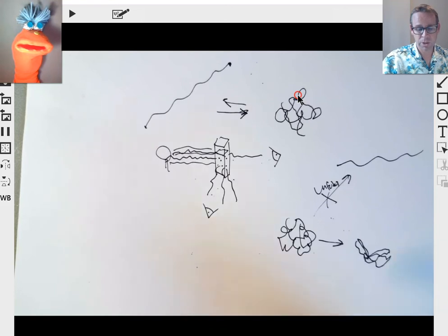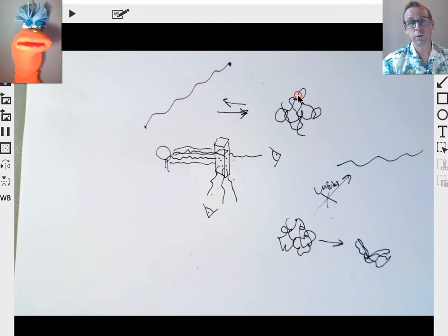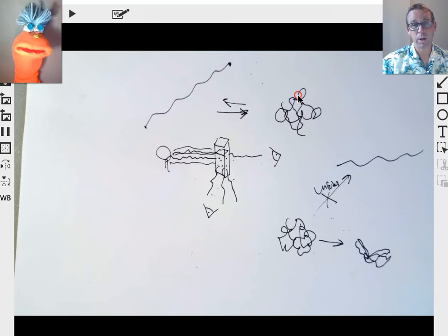Okay, and that's kind of like what we saw in that last lab, is that as you increase the concentration of dimethyl sulfoxide, the catalytic ability of the myoglobin decreases, and that's because the DMSO is unfolding the protein. The interesting thing about that, though, is that even with very high concentration, you still have myoglobin that can react well.